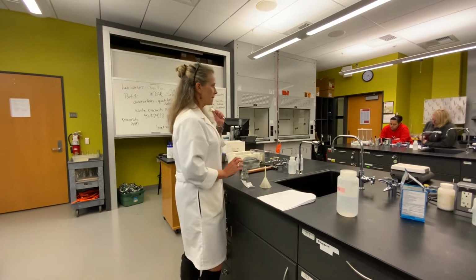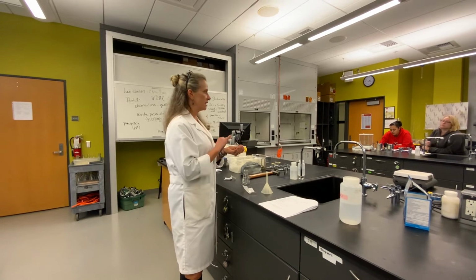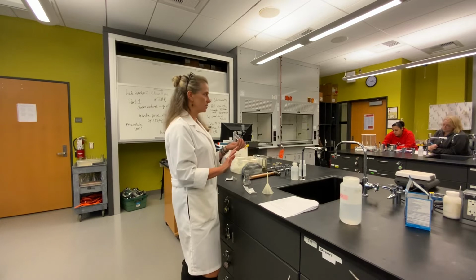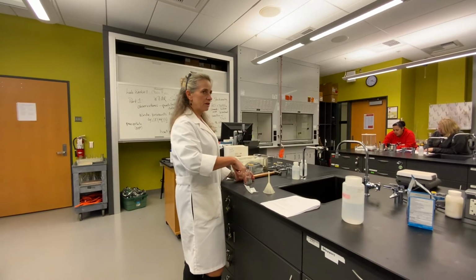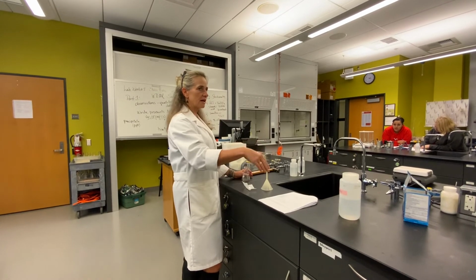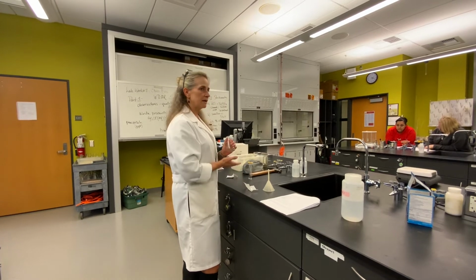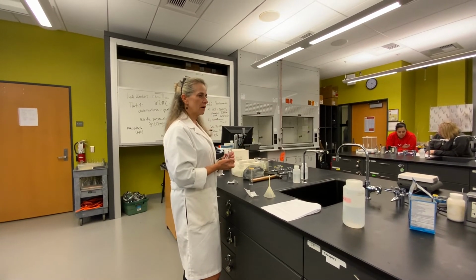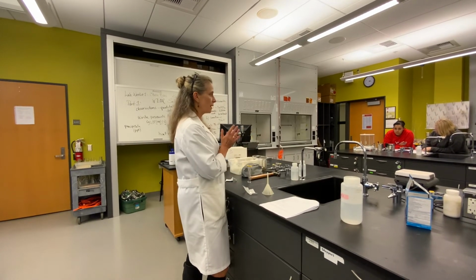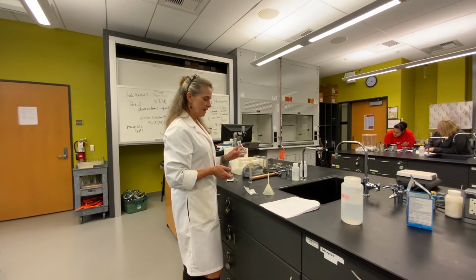Same thing, we want the mass of the empty graduated cylinder, but don't bother cleaning it out. It's got acid in it, it's fine. Whatever mass it has is perfect. It's okay. Don't try to dry it out, it's all good. 25 mils of hydrochloric acid in, just like before. Weigh it again. Okay, again, you're not measuring exactly. Somewhere below 25 is perfect. Okay, empty Erlenmeyer, again, don't worry about washing it out. I would maybe rinse it to get the previous reaction out of it, dump it down the sink, put the wet thing on the counter, or on the balance, it does not matter. Okay, so don't waste time.